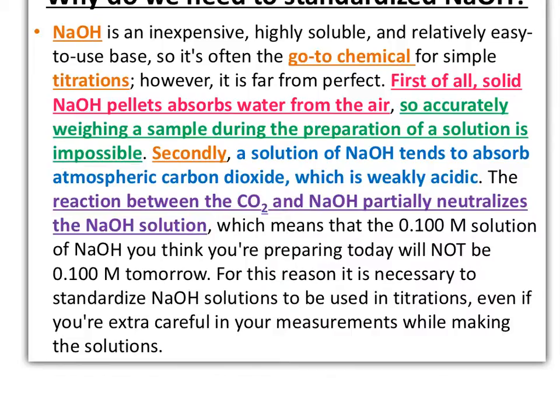Secondly, a solution of NaOH tends to absorb atmospheric carbon dioxide, which is weakly acidic. When you take something that's acidic and something that's basic, what happens when you mix them? It's that N word. They neutralize. This reaction between CO2 and NaOH partially neutralizes the NaOH solution, which means that a 0.1 molar solution of NaOH you think you're preparing today will not be 0.1 tomorrow or within the next hour.